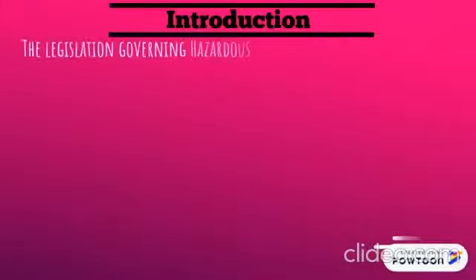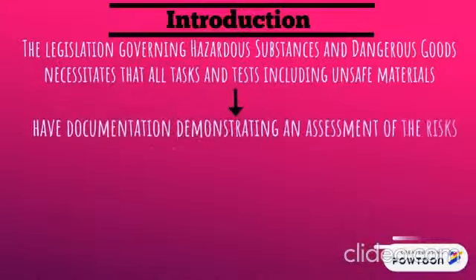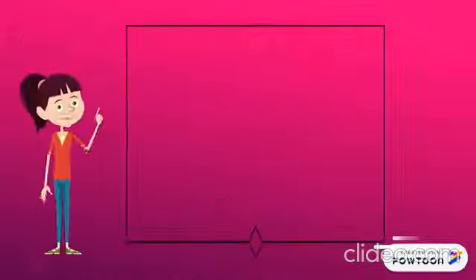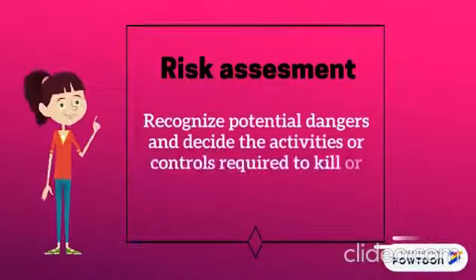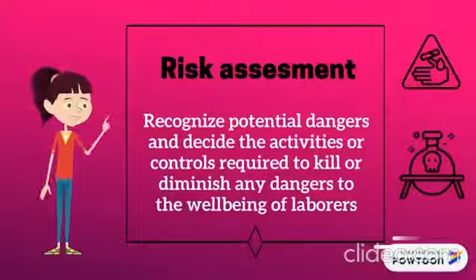The legislation governing hazardous substances and dangerous goods necessitates that all tasks and tests, including unsafe materials, must have documentation demonstrating an assessment of the risk involved and the usage of controls to limit exposure or the possibility of an emergency. A risk assessment ought to recognize potential dangers and decide the activities or controls required to eliminate or reduce any dangers to the well-being of workers.